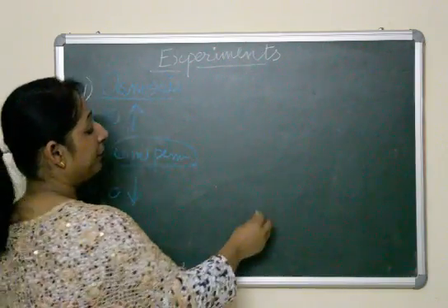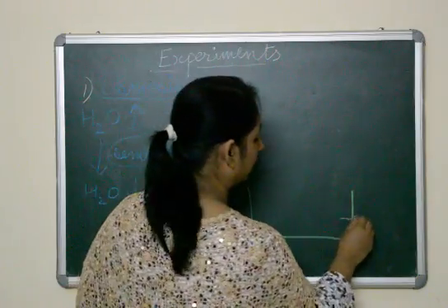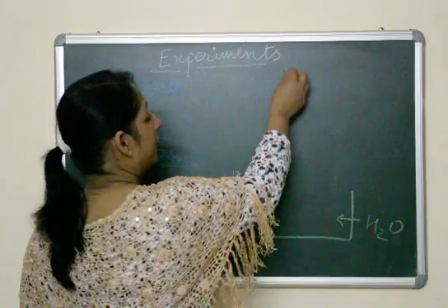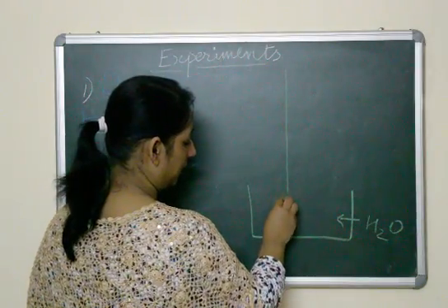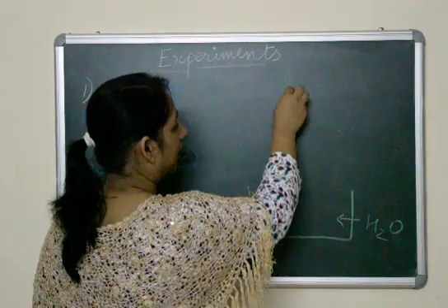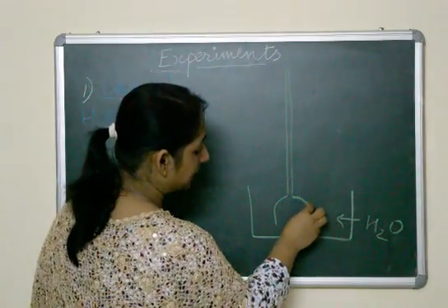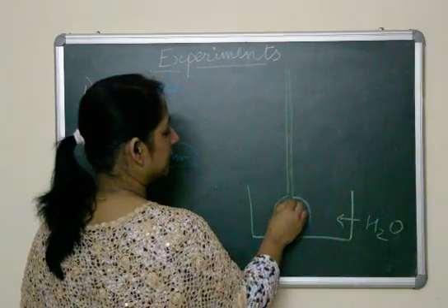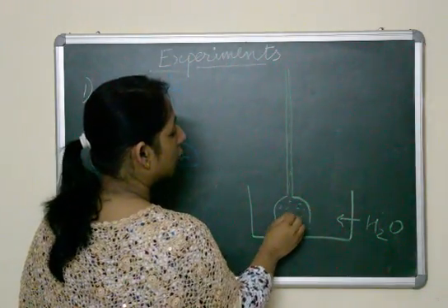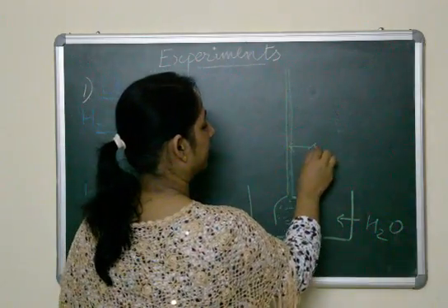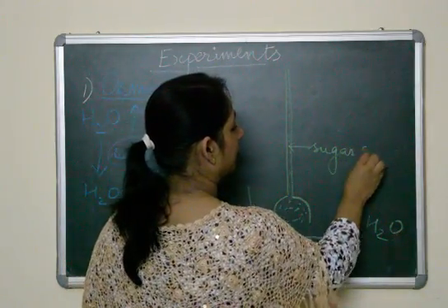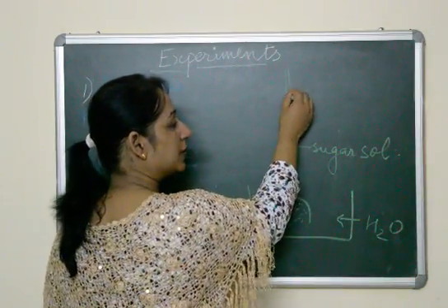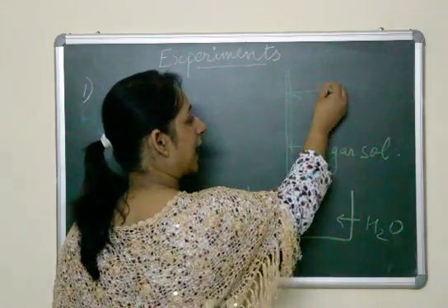For this experiment, we are going to take a beaker filled with water, and in this beaker we are going to place a thistle funnel. In this thistle funnel we are going to place sugar solution, and we will mark the level of the sugar solution as A.